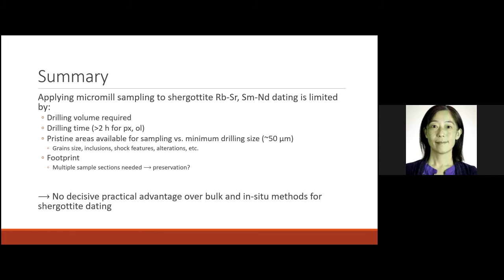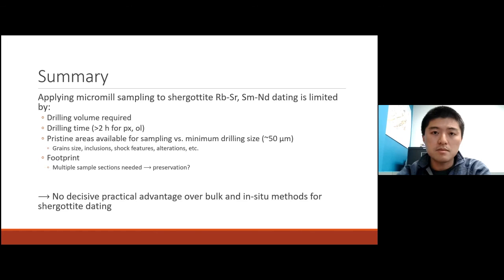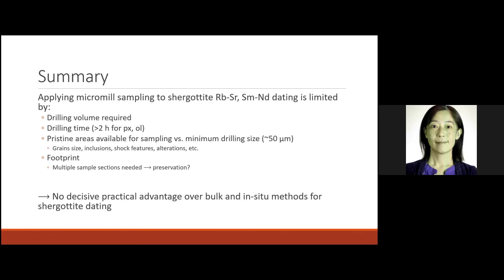That's really little for us, because you need to weigh those precisely. It's not critical, because if we're talking about an isochron, you can just do the ratio. But you still need to weigh, spike, and digest. So do you have the capability to get that low an amount?